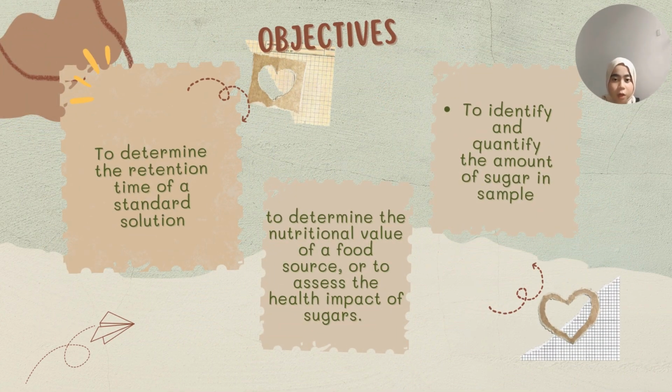About the objective. The first one is to determine the retention time of a standard solution, secondly to determine the nutritional value of a food source or to assess the health impact of sugar, and lastly to identify and quantify the amount of sugar in the sample.